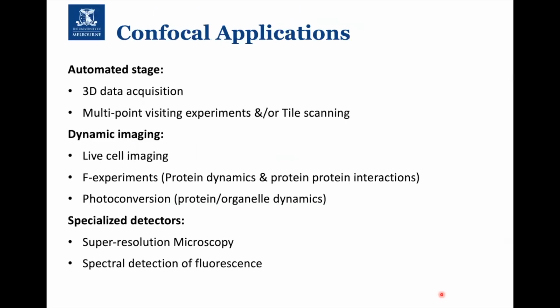Okay, confocal. So there's a lot that you can do on a confocal microscope. Again, it's probably a 1-hour lecture in itself. So we can make use of automated stage functions for doing things like 3D acquisitions or multi-point visiting experiments or tile scanning if you have large samples.